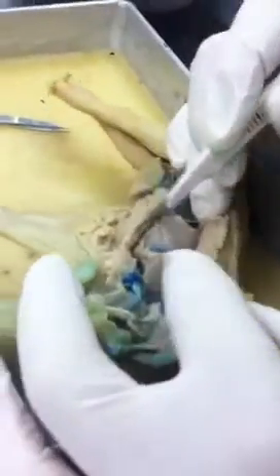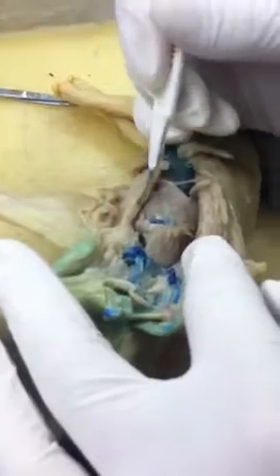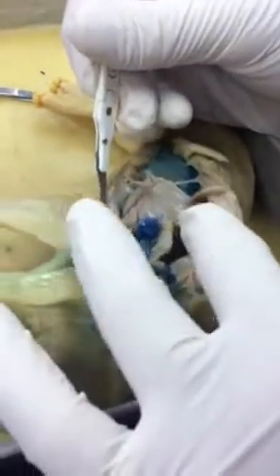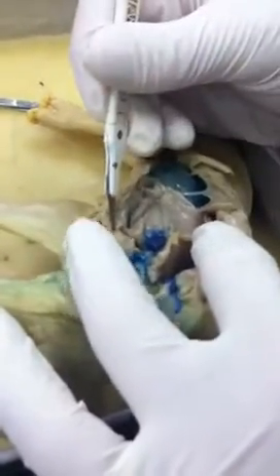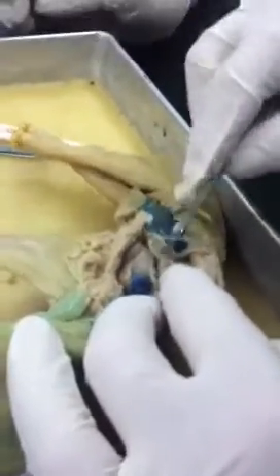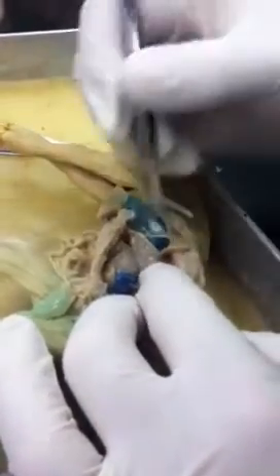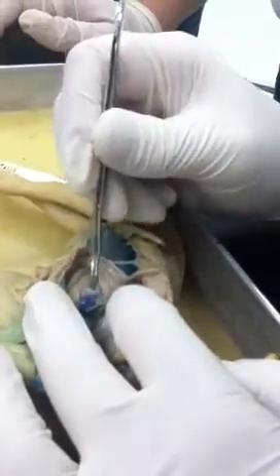And you found the thyroid right here. Is that the one we were looking at earlier? No, that was the thymus, in between the heart and the lungs, when you were over there at the trachea. So the thymus was the one that overlaid the heart, between the heart and the lung. And the thyroid is the one just below the trachea. Yeah, it's on top of the trachea, just below the larynx. I think I got that. I always get those two memorized backwards.